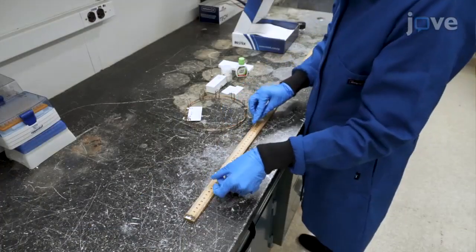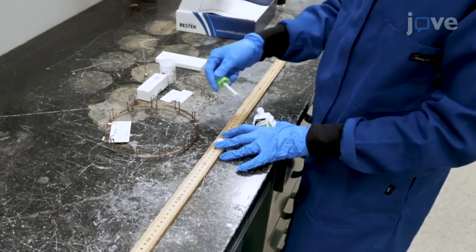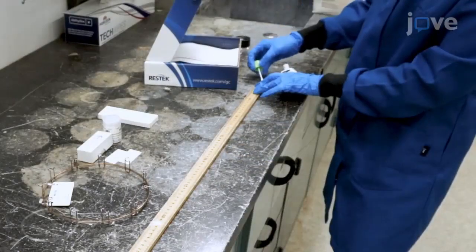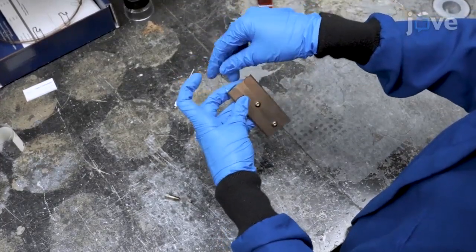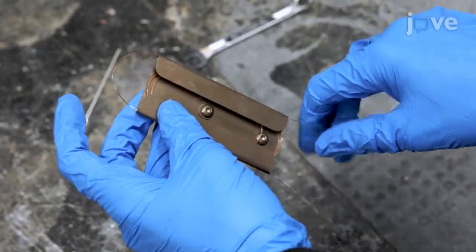Cut 2.75 meters of the secondary column and use a whiteout pen to place a mark on the column at 0.375 and 1.375 meters. Place the secondary column into the ZoX modulator column holder and use the marks as guides for creating a 1-meter loop within the holder.